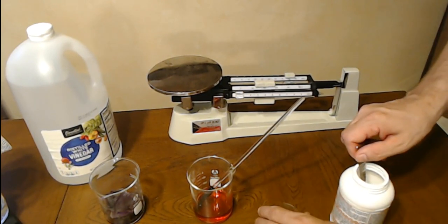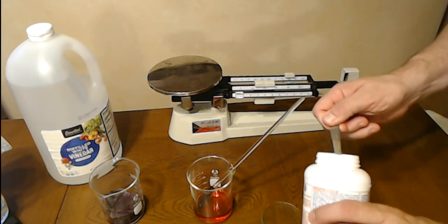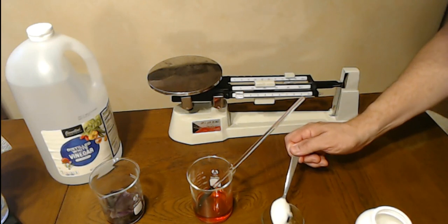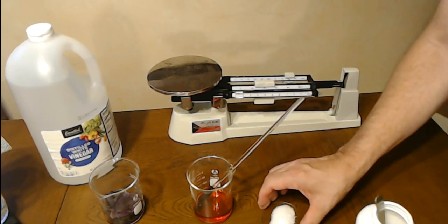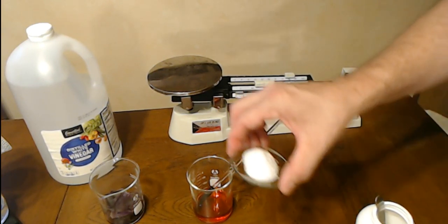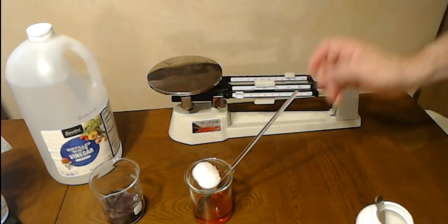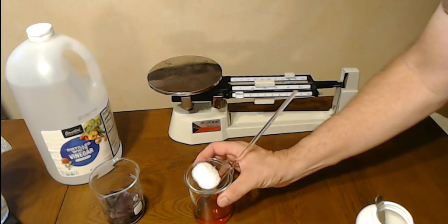So what I'm going to do is I'm going to take some of this lye. Well, one thing you should definitely use while you're using lye is eye protection. If you get lye in your eyes, it will, first of all, be very painful and can cause damage, possibly permanent damage. So wear eye protection while doing this. So we're going to place our lye on top of there. So we got our lye, our vinegar, our pH indicator all there, all ready to go.